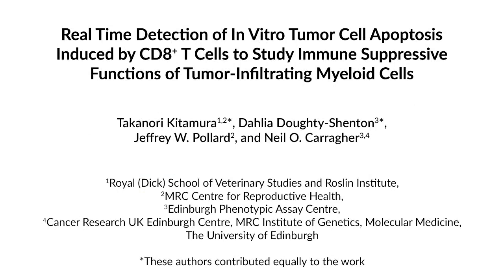Our protocol assesses the effects of myeloid-derived suppressor cells and the tumor-associated macrophages on T cell-induced tumor cell apoptosis, alongside investigation of the underlying mechanisms of potential therapeutic interventions.